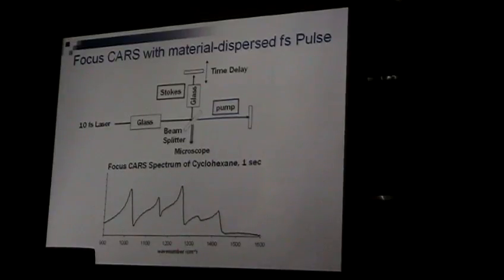Actually, it took 3 months to get this glass. It's some weird, strange glass, named SF57. I ended up ordering it from Pudong. It took 3 months to buy this in the US, because this company does not have any business with the US. Anyway, at the end, I got the glass.